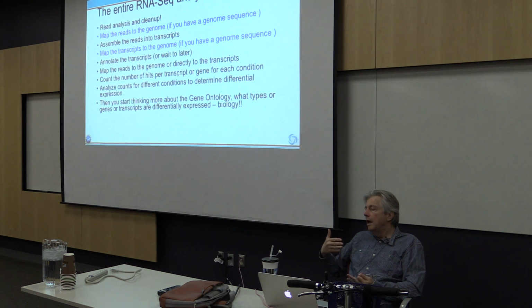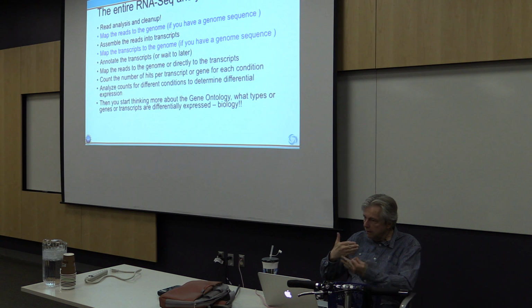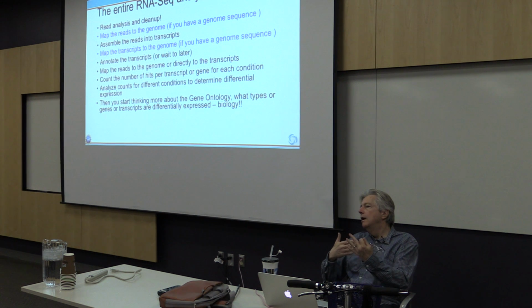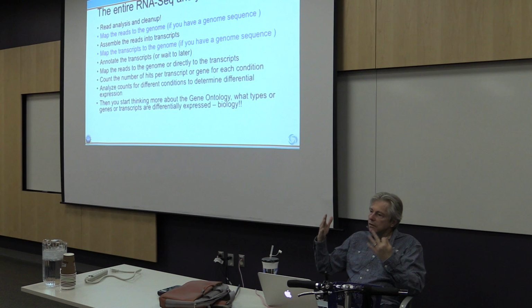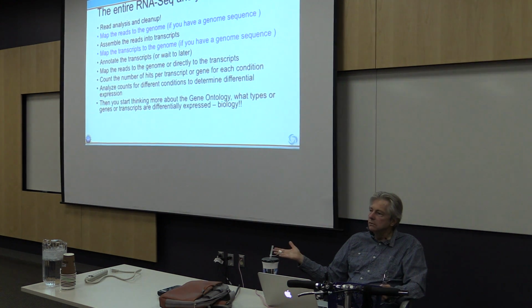The programs that we'll be using are fairly sophisticated at tying them together, and it's hard as a new user to understand, and even for me, who's used these a lot, to really know exactly what each step is doing. But you have to get a feel over time of what works, and sometimes you want to err towards gathering information that's new, because you're working with a tissue that most people haven't looked at before, or cell type.